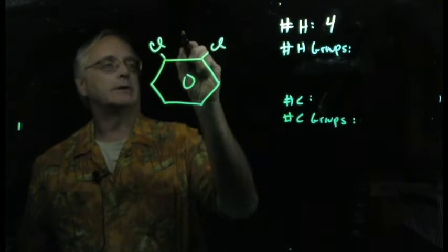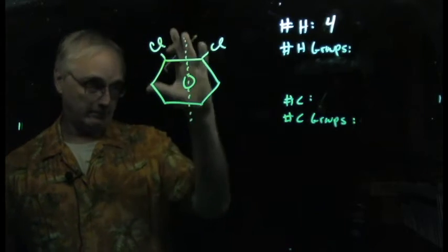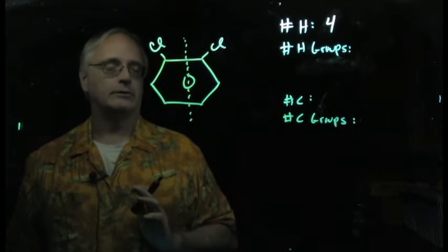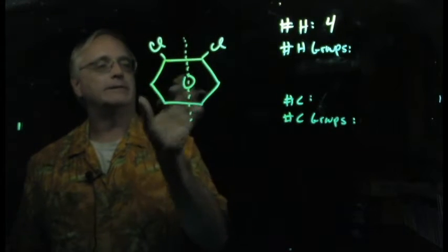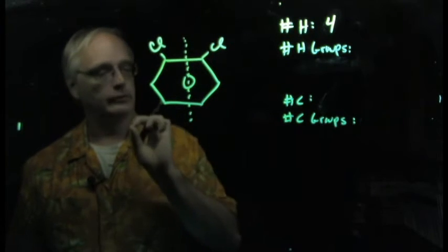This one is symmetric, and it is sometimes a good idea, especially when you're getting used to doing this, to note where that symmetry plane is. The left side and the right side of this molecule are symmetric. That's going to mean these 2 protons form one group.